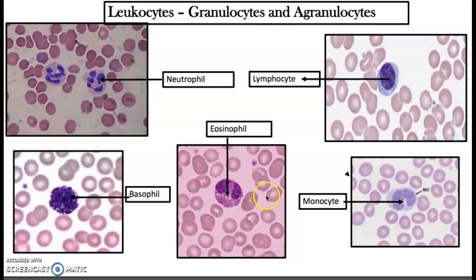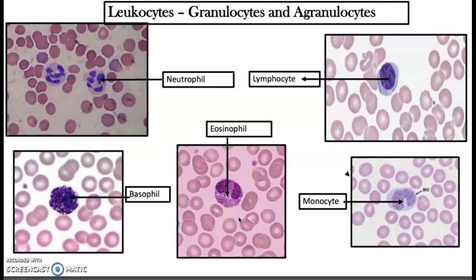Eosinophils are easily distinguished by their large, prominent, and bright reddish cytoplasmic granules. These cells stain bright red in acidic dyes — 'eosinophilic' means rosy red. These eosinophils are phagocytic, but their primary function is to attack parasites that are too large to be engulfed; they kill by attaching to the parasite and releasing toxic substances. They are also elevated in allergic reactions. Neutrophils can be up to 65% of white blood cells, while eosinophils are between 2 and 4%.